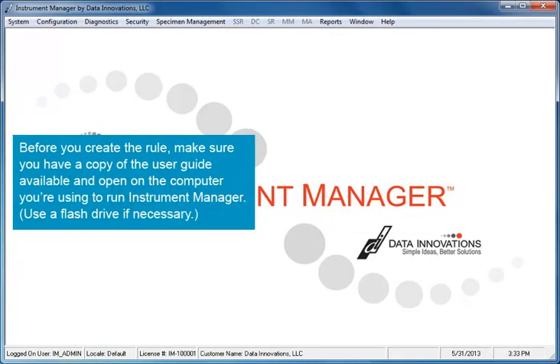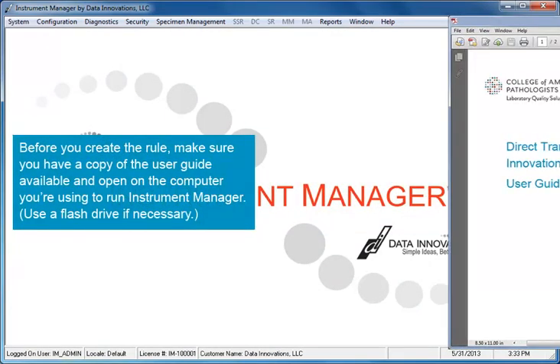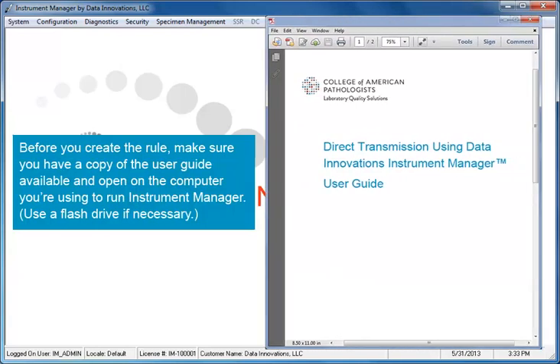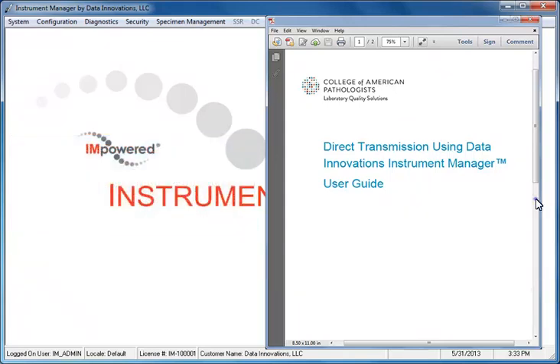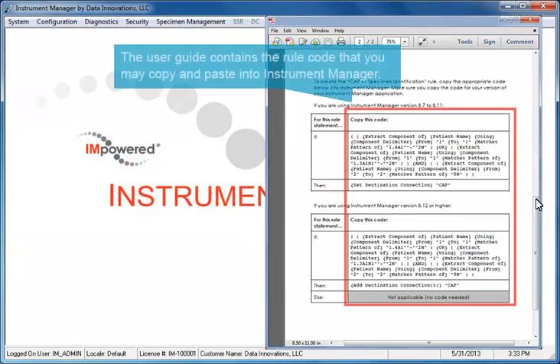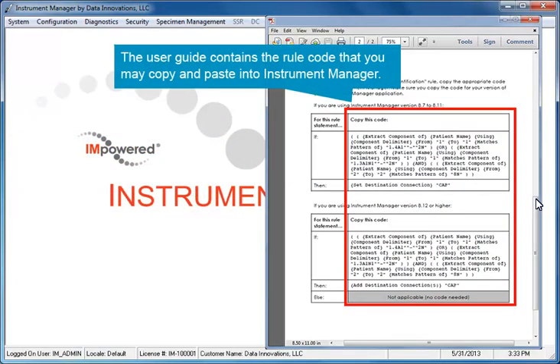Before you create the rule, make sure you have a copy of the User Guide available and open on the computer you're using to run Instrument Manager. Use a flash drive if necessary. The User Guide contains the rule code that you may copy and paste into Instrument Manager.